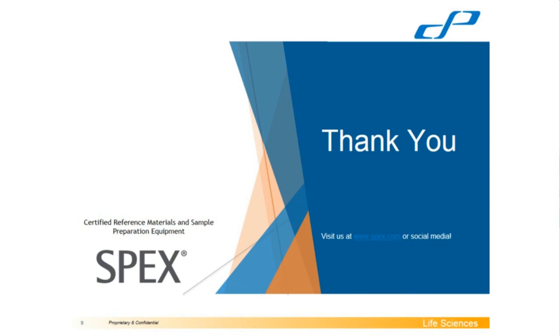Excuse me. So you're going to want some sort of method translator. Most of the column manufacturers and most of the instrument manufacturers have a method translation software or some sort of tool on their website, and you can plug in the conditions that you start with, plug in the conditions for your system, and it will translate how to change that method so that it will match similarly to the method you found online. But always look online as a place to start. It's always a great place so you don't have to reinvent the wheel totally.